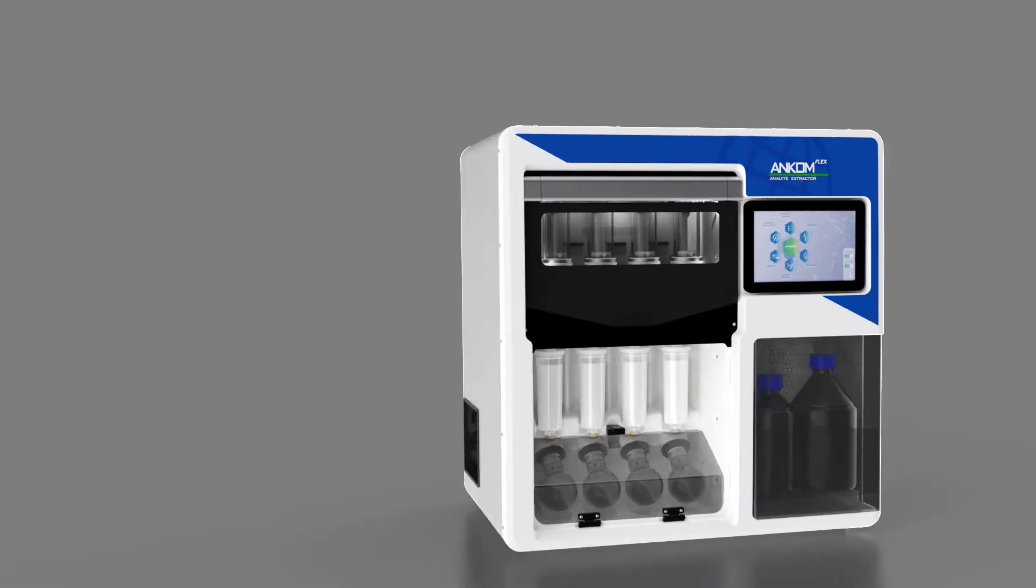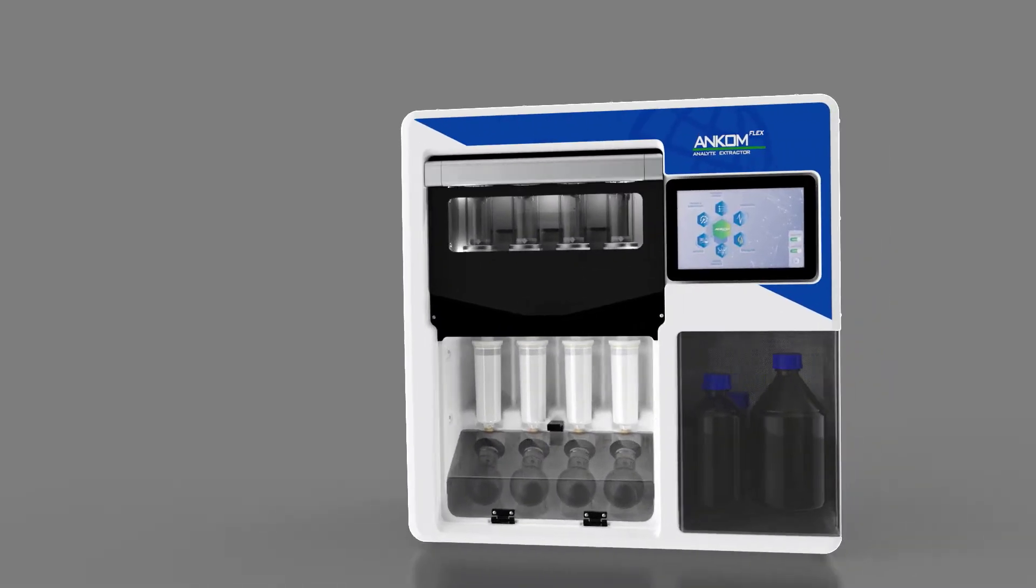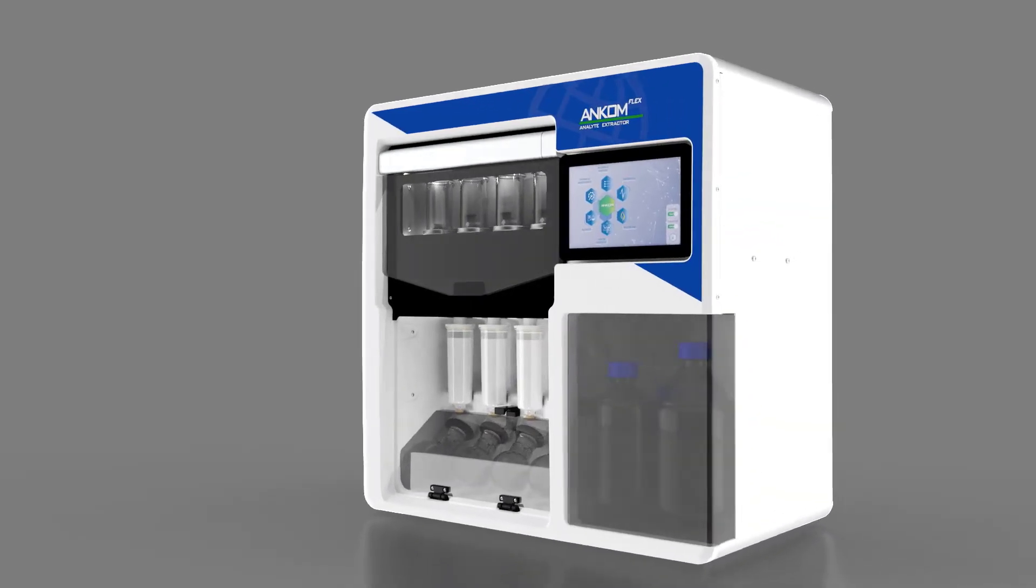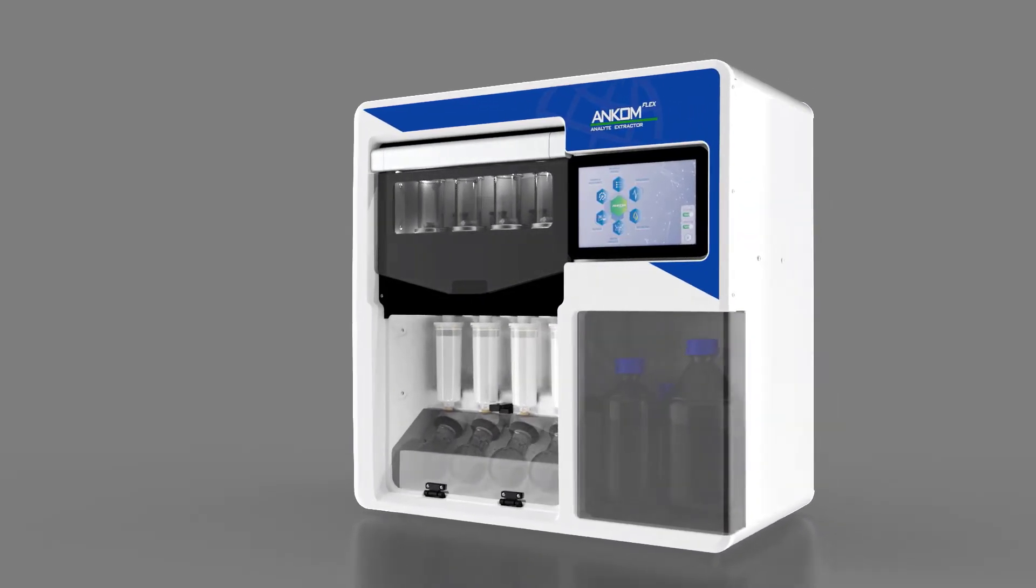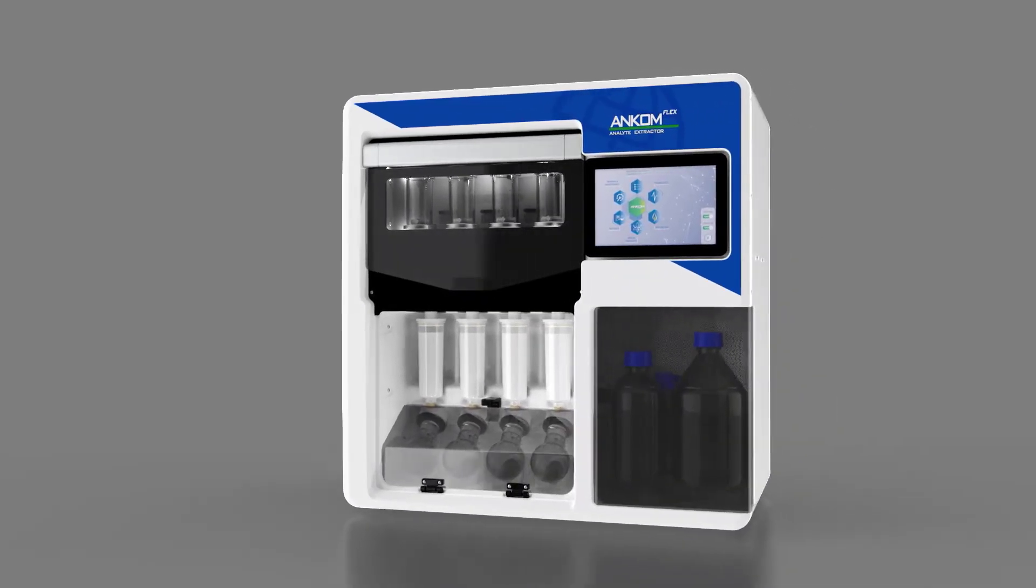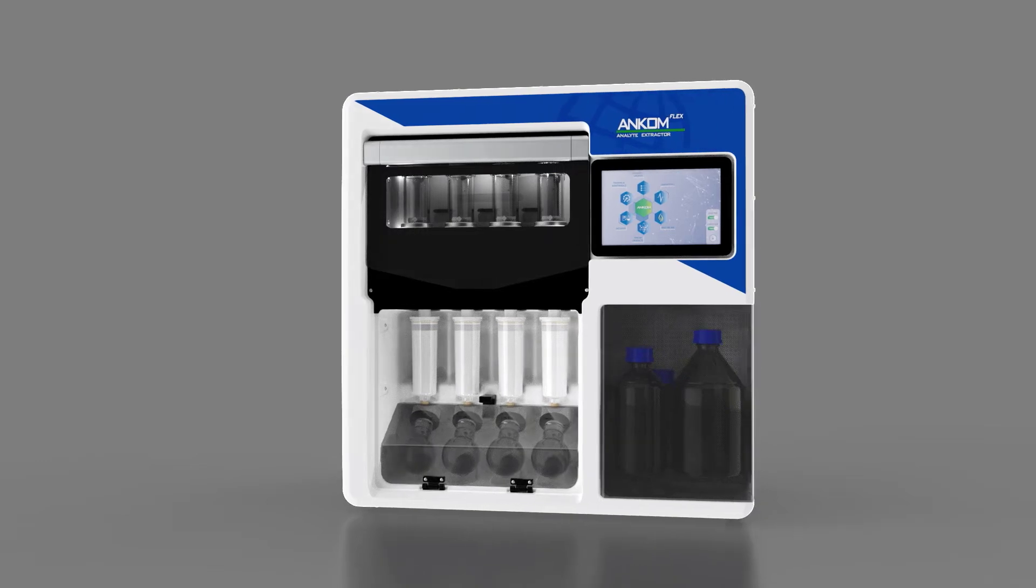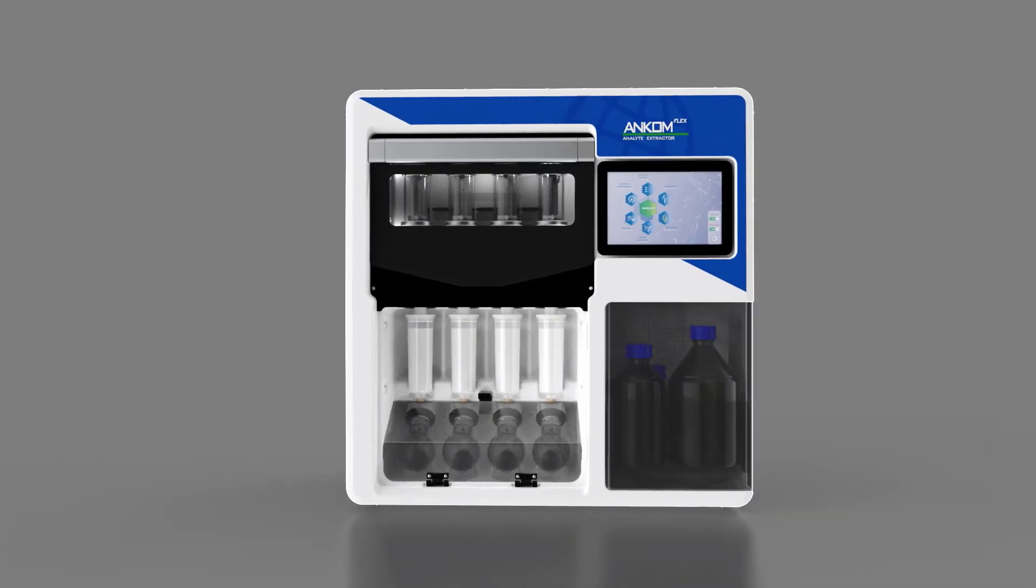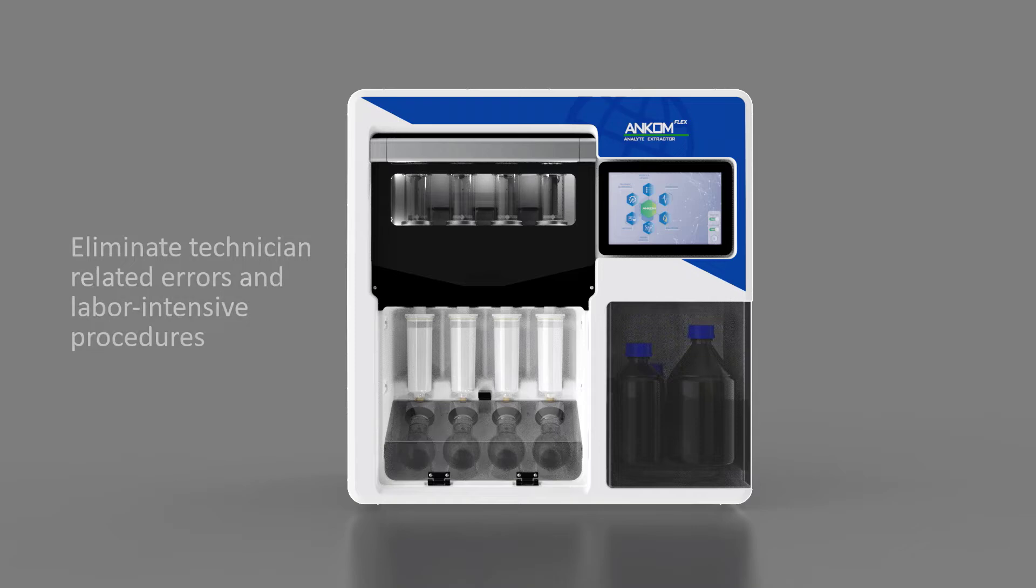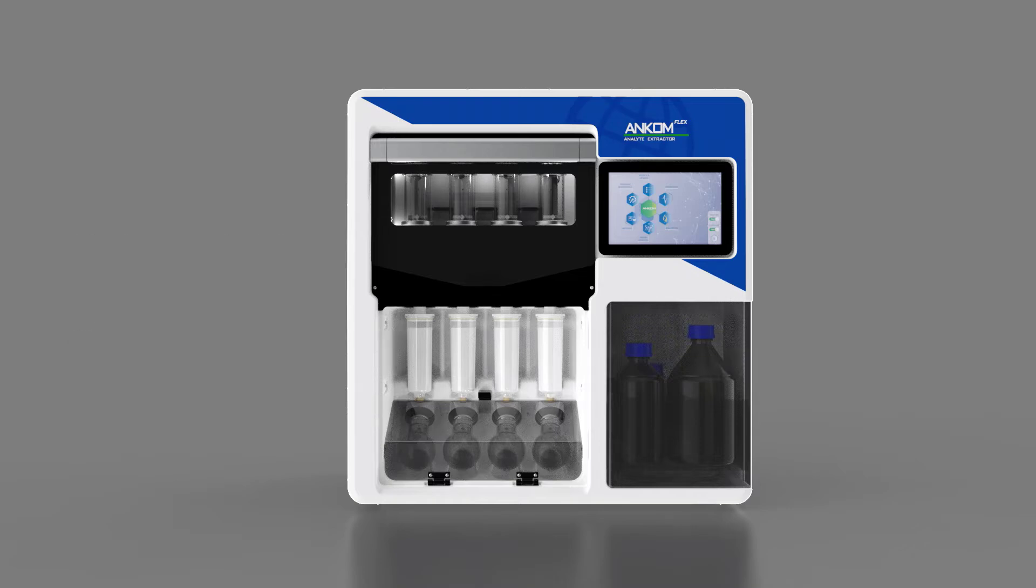With the new ANCOM Flex Analyte Extractor, ANCOM Technology raises the bar on laboratory innovation. The instrument's revolutionary design and advanced software technology eliminates technician variability and labor-intensive procedures involved in sample preparation for vitamin A, E, and D analysis.